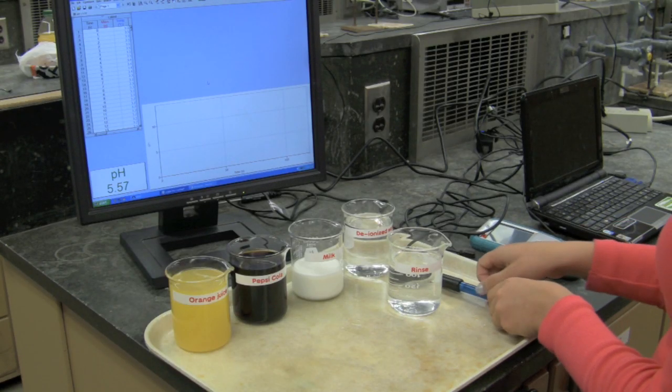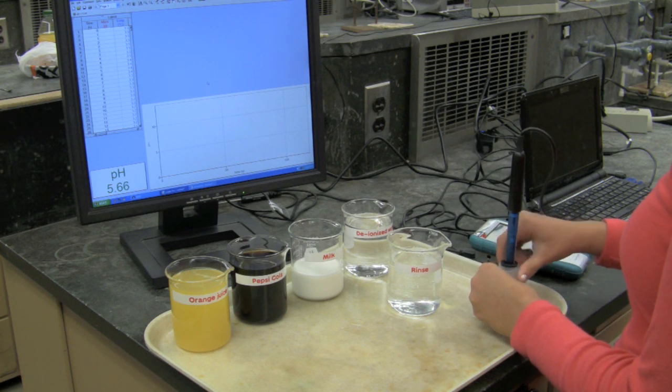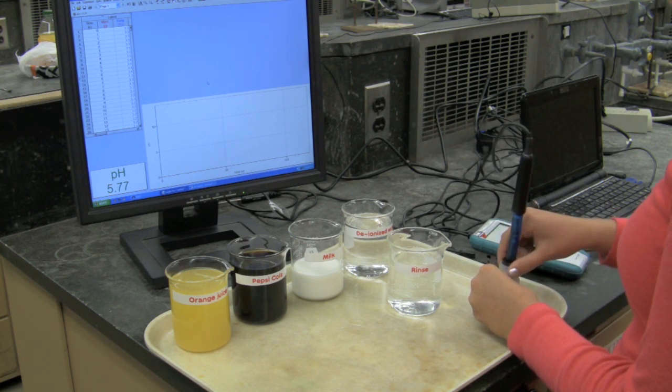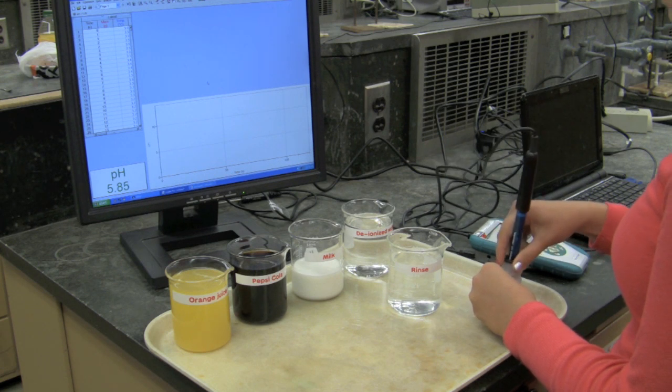A student will measure the pH of different solutions without visual aid. The student is removing the pH probe from its container and places it in a rinse for a couple of seconds.